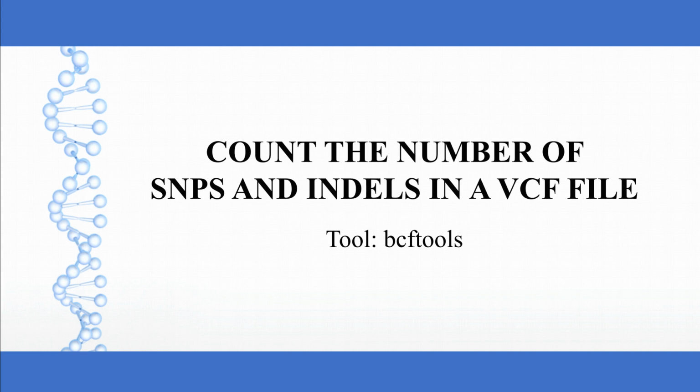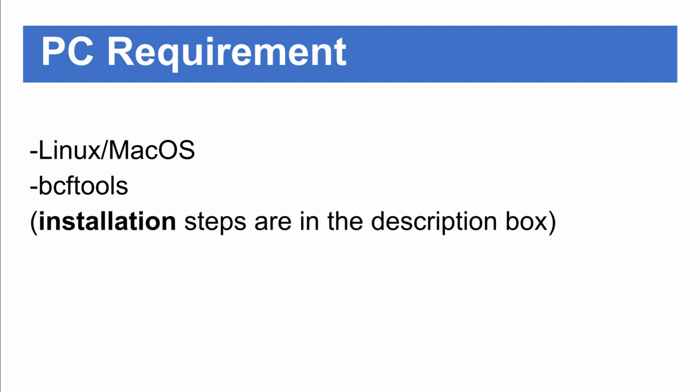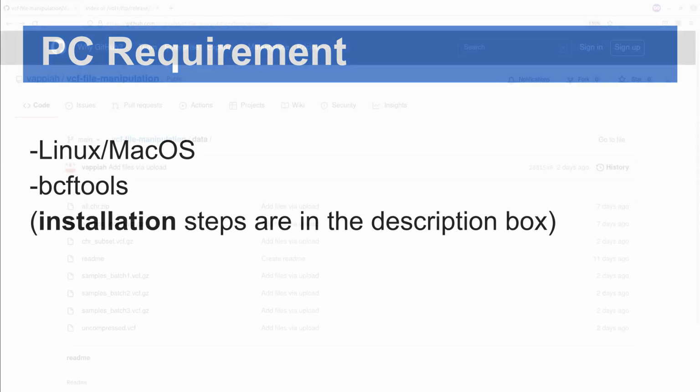In today's video, I am going to show you how you can count the number of SNPs and indels in the VCF file using bcftools. In order for you to follow this tutorial, you need to make sure you have installed bcftools because that is what we are going to use. Once you are done with that, we can proceed. Without further ado, let's start the exercise.